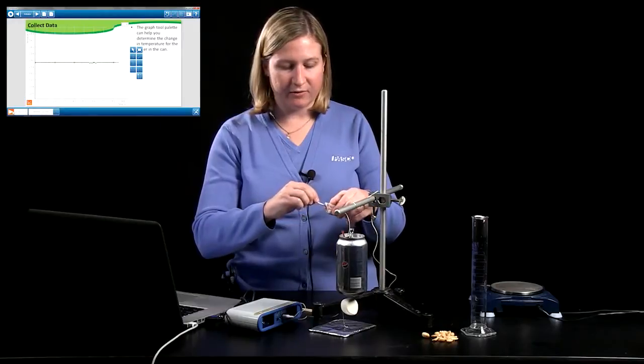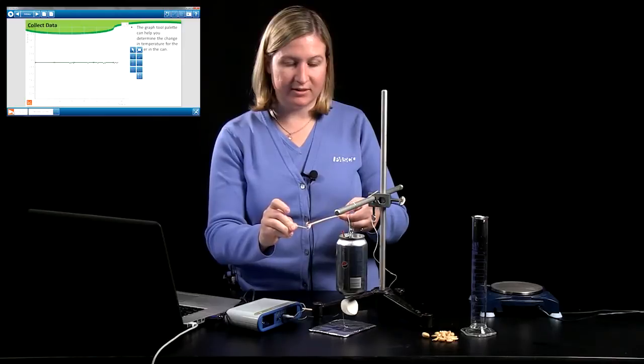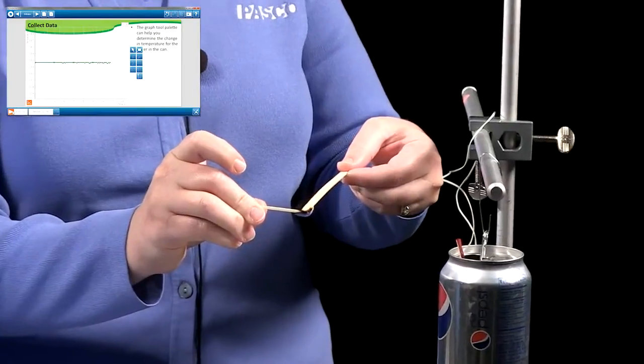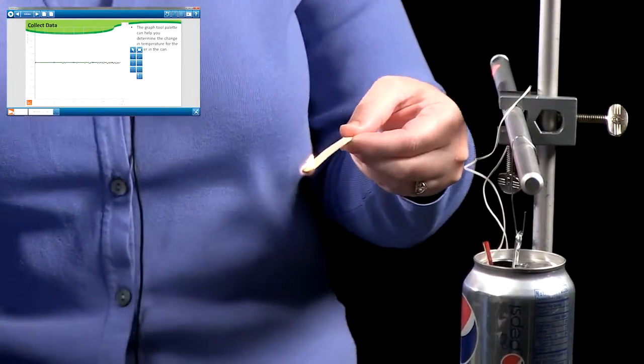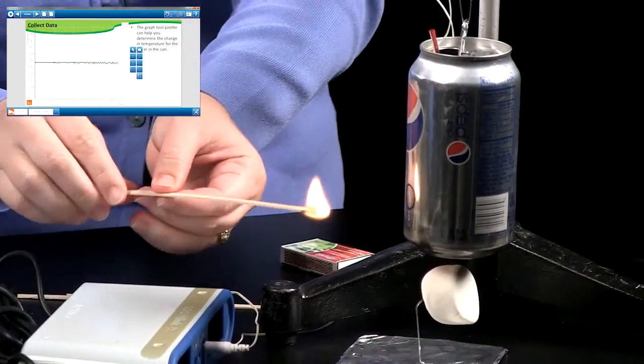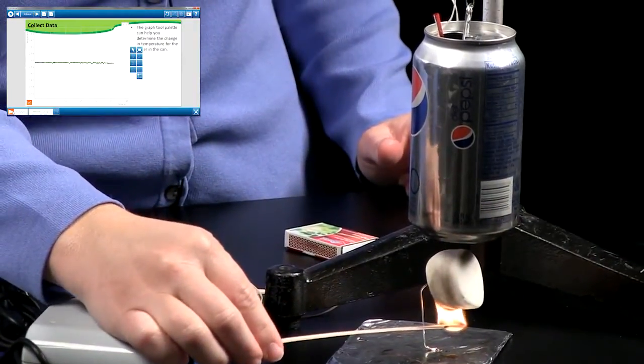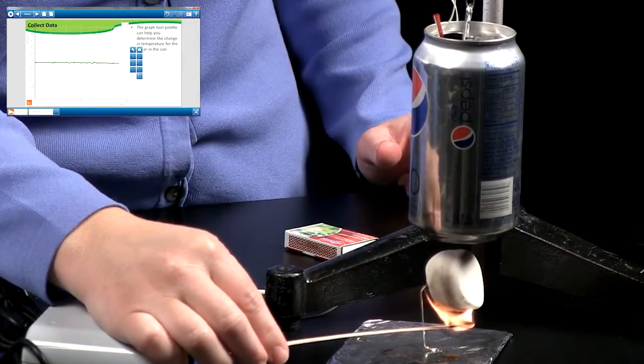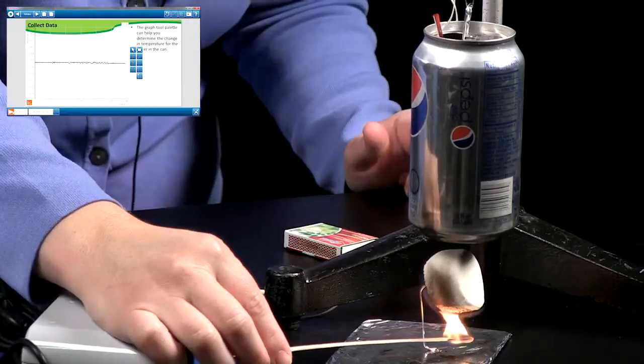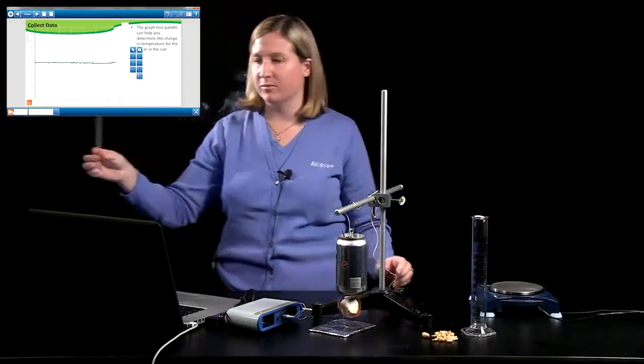Now I'm going to light the food and use a match to light a long wooden splint. This will help you conserve matches. When students try to light the food with a match, they often burn their fingers or drop the match. So if you light a wooden splint, the students can keep their hands well away from the flame.